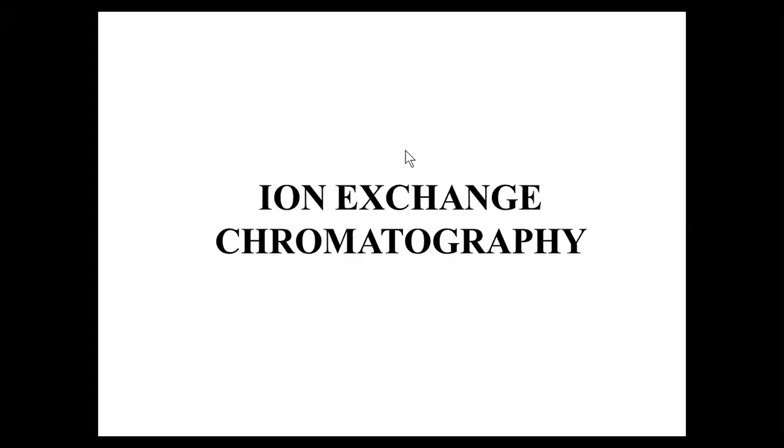If you look at the schematic of HPLC instrument, a pump, sample solvent reservoirs, the sample injector, column, detector, and display unit. These are some important components of HPLC instrument. If we adopt the principle of ion exchange chromatography for the separation of solutes by HPLC, we may have to use the detector for the detection of solute molecules after they eluted from the chromatographic column and once they reach the detector. We will be commonly using electrical conductivity detector in ion exchange chromatographic separation.